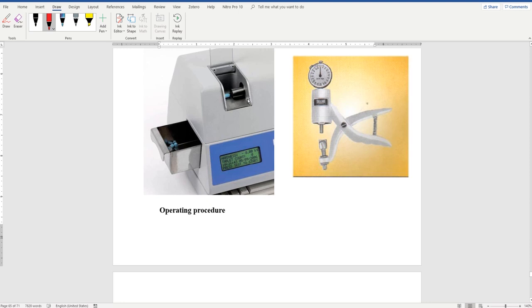Most machines will also measure the diameter of the tablet at the same time as the resistance to crushing strength. So you need to take 10 tablets and position them always in the same way. Before you position any tablet, first clean this area from any broken parts or fragments of previous tablets.